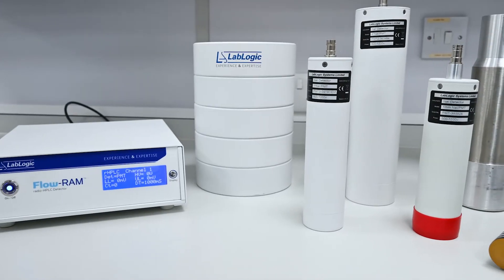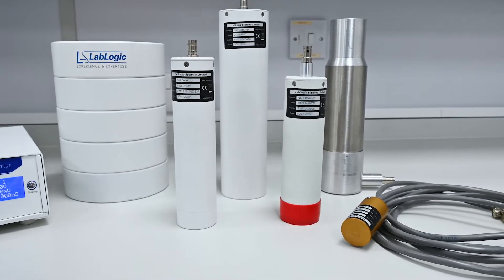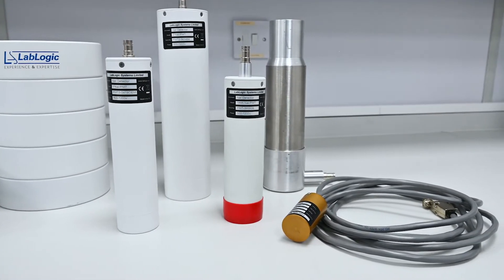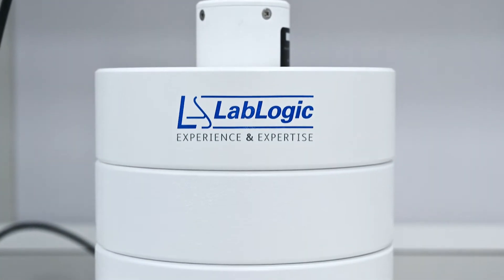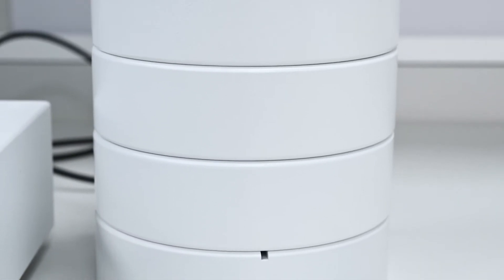The FlowRamp is compatible with a wide range of detectors for both PET and SPECT applications. The lead shield minimises background radiation and interference, resulting in an improved signal-to-noise ratio. We have a range of lead shields available to suit different detectors.